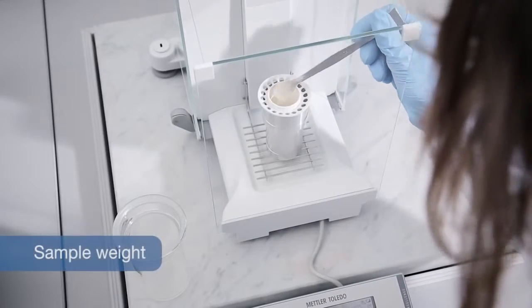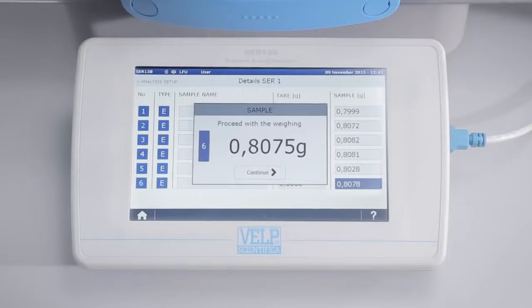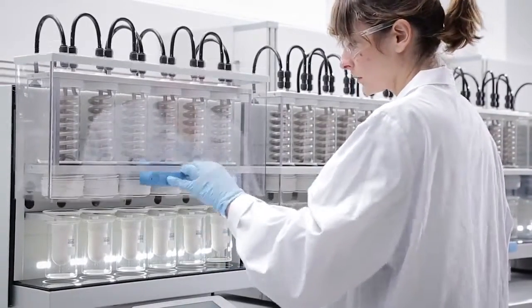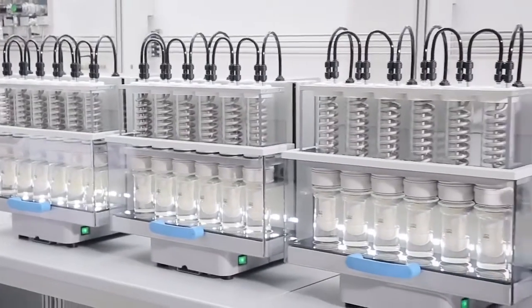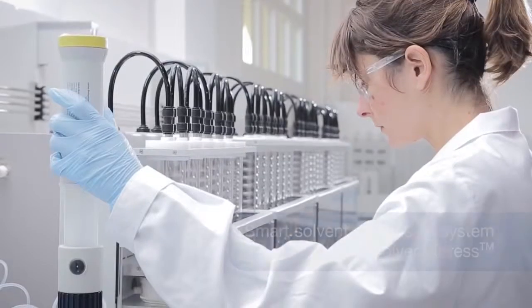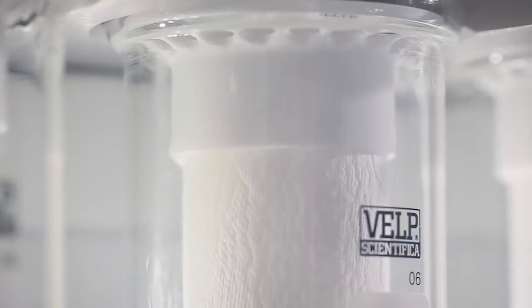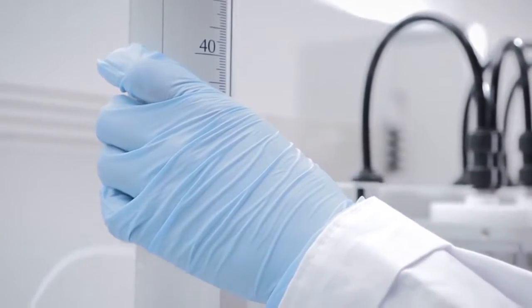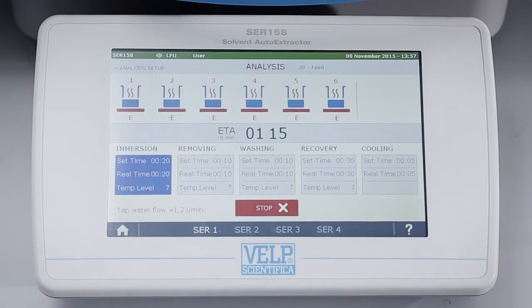Weigh the homogenized sample directly in the VELP extraction thimbles and select the positions required. Position the extraction thimbles, select the method and add the solvent. The automatic VELP solvent dispensing system, Solvent Express, minimizes exposure to the solvent, ensuring operator safety. Then simply press start to begin the extraction process.